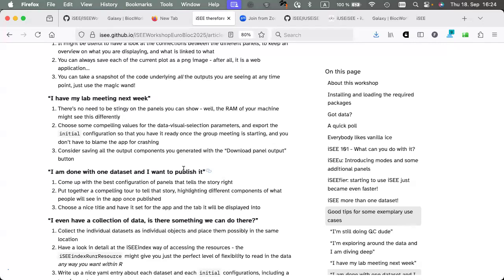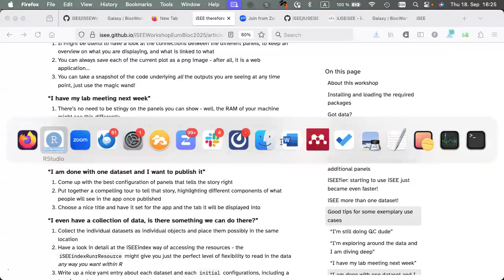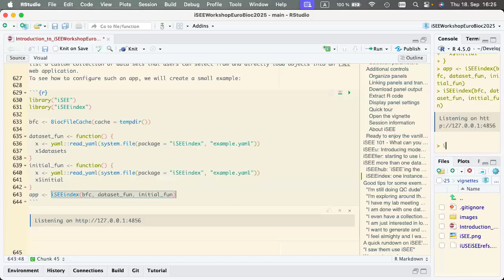They don't get back to us also because this is almost bug free. We have a good amount of unit testing that actually makes sure that people don't screw up. There's actually a fun option inside iSEE where you can actually show some bugs on the plots.